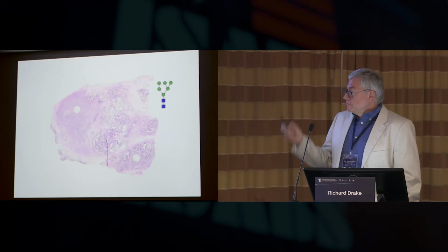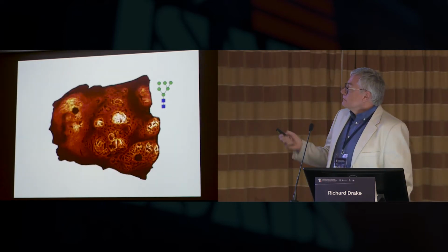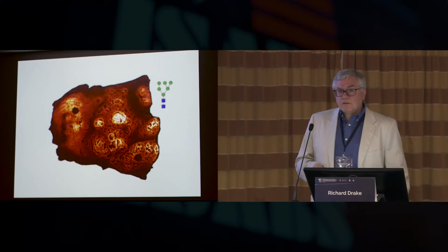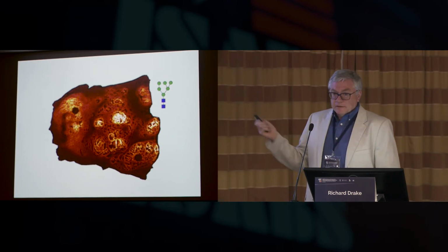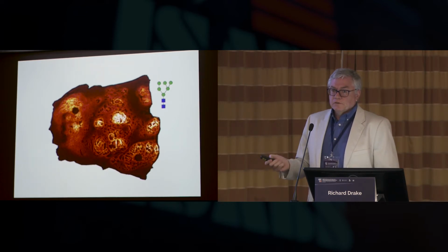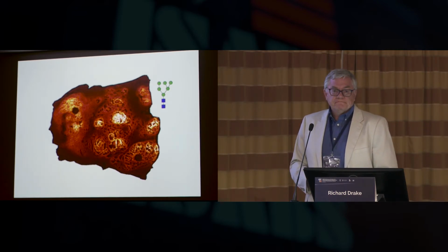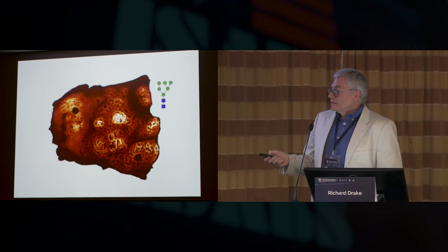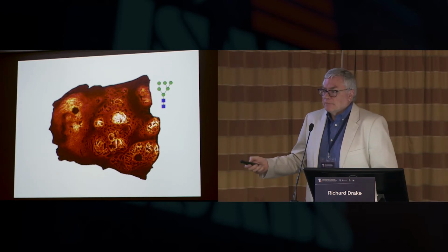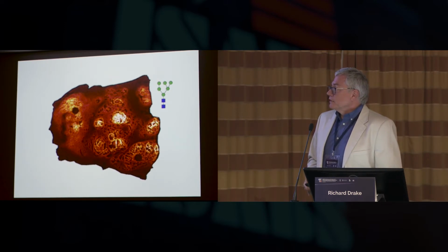This was that prostate tissue that I showed up front with the high mannose. And what we do see with the high mannose is that we looked across many, many different tumor types. In prostate, yes, we see lots of high mannose in the tumor, but we also see lots of high mannose in hyperplasia regions. If we look in colon, we'll see them in adenomas. There's other tumors where it's only showing up in the tumor. So it's kind of case by case. In no scenario do they seem to be good indicators of something good happening. Hyperplasia, tumor, so it's something we're keeping an eye on.